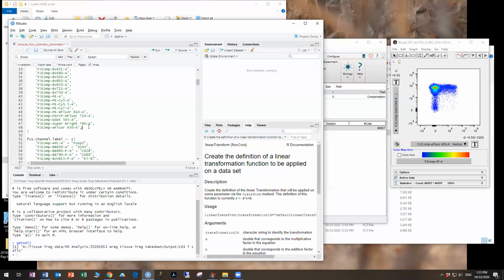All right, and after the last one, no comma. Then hit save. So that's the first one. Those are the FCS channels. And you can see there's more because we're using the Aurora rather than the Symphony, which the original parameter file was for. Next, we need to type in the FCS channel labels that correspond to these.